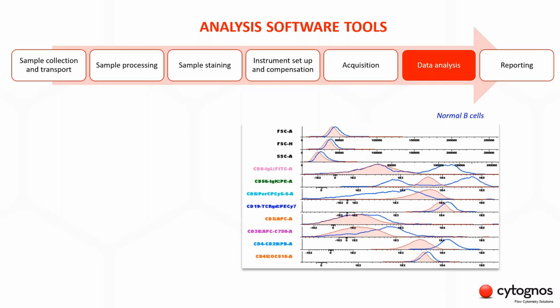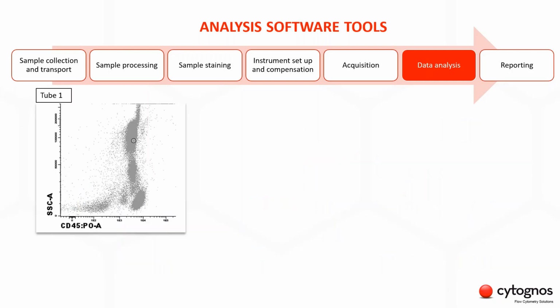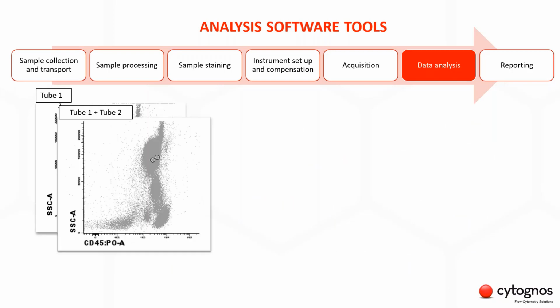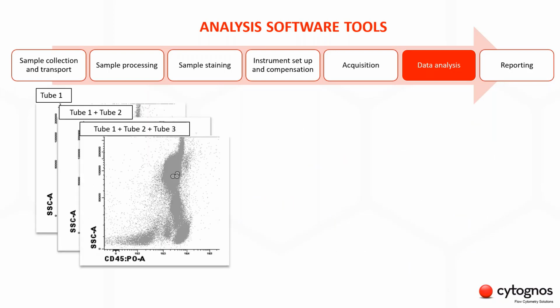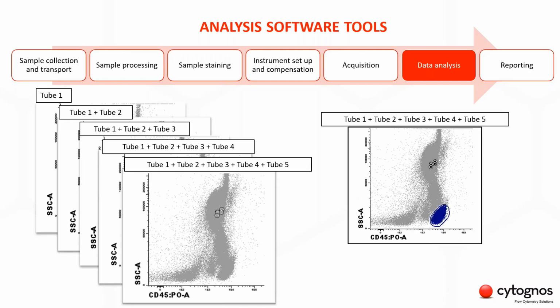But also we can follow up patients with confidence by loading the diagnostic population onto the MRD case as a reference. Using advanced tools, we can analyze the patient case, not a single tube. And this is very important as we can combine all the tubes from the panel, analyze them together and create one single report. So we are getting one case, one report.